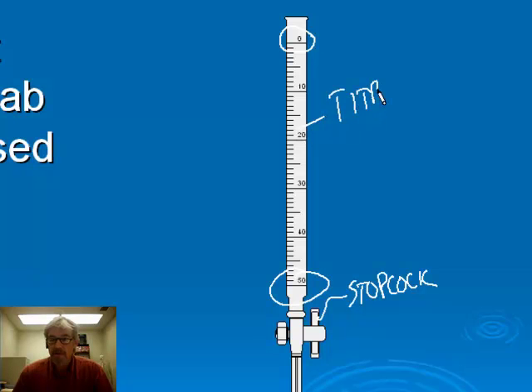and sometimes this titrant is a standard solution, and that means a solution of known concentration. Sometimes the titrant is of unknown concentration as well. Another term that's used in describing titration is endpoint. The endpoint is the point in the titration where a visual cue, like a color change, or an instrumental cue, like a reading on some kind of meter, will tell you that you've just used up one of the reactants and changed the limiting reactant to the other reactant, which means the reaction has just completed.